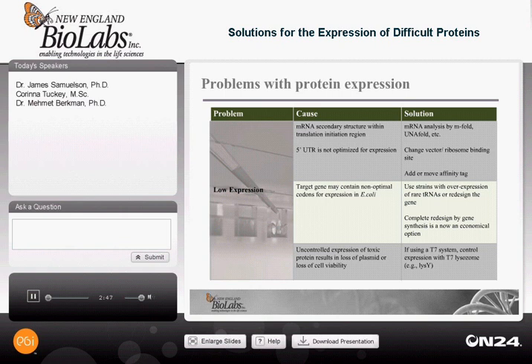However, expression problems are most often due to open reading frames with non-optimal codons for E. coli. As a solution, various expression strains are available that offer higher levels of so-called rare tRNAs, but the best solution today may be to completely redesign the gene. And this is now very economical, as many companies offer this service. A gene can be ordered, it is optimized for E. coli expression, and it can be at your lab within 3 weeks.